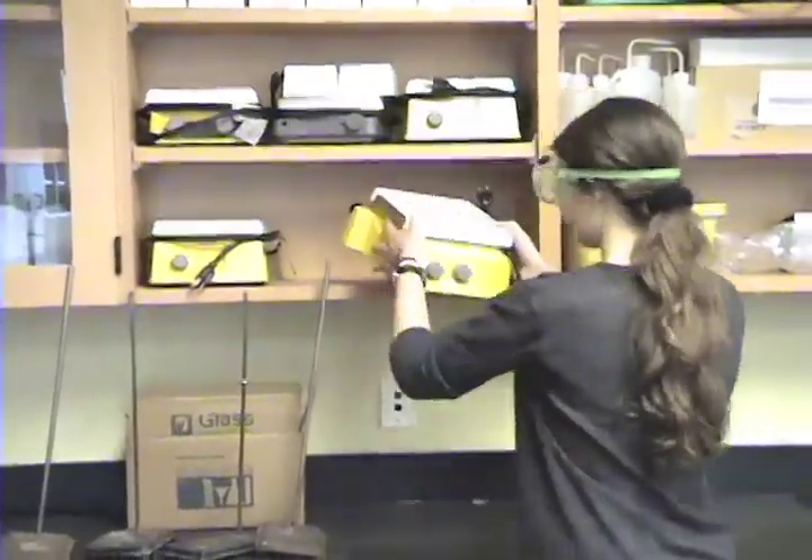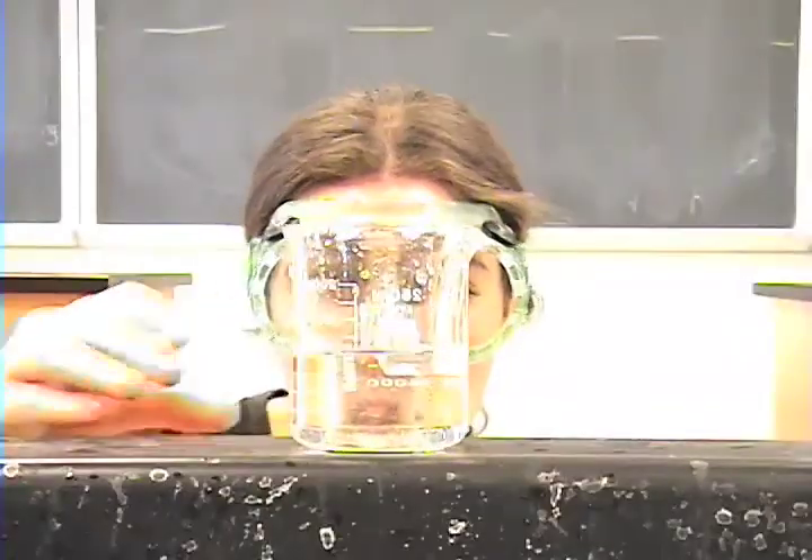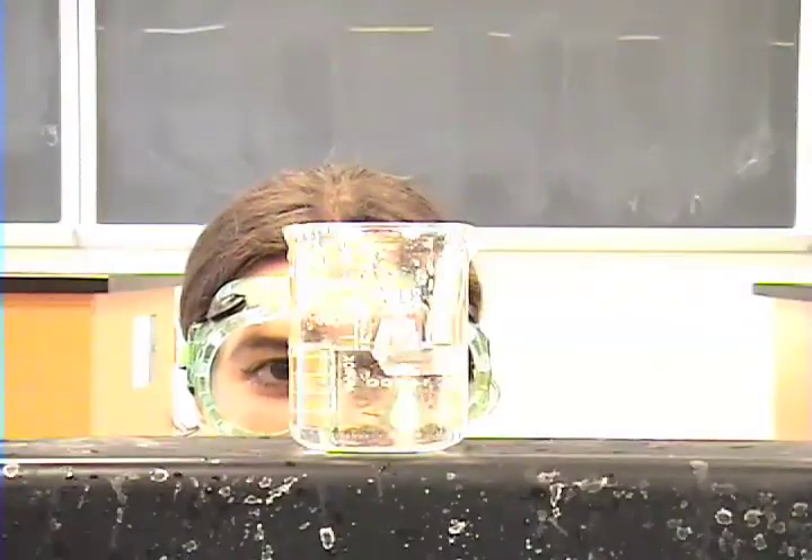Know where materials are located around the room and don't rely on others — asking 'Emily, where are the hot plates?' is not acceptable. We see the lab partners setting up. Meticulously measure the precise amount on a flat surface.